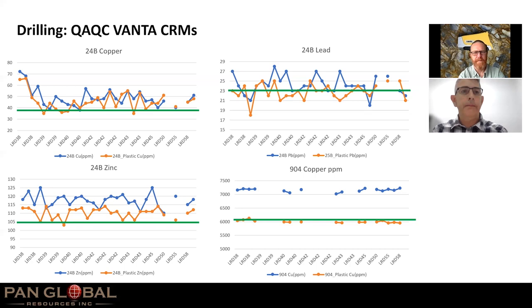Just understand the effects. And you're doing 30, 30, 30, right? Yeah, 30, 30, 30. Sometimes we'll change it. The 30, 30, 30 is not a really long run time, but it's not a short run time either. So for us, it works.